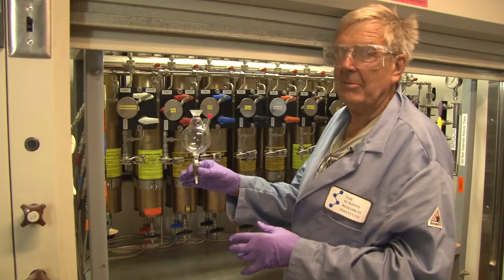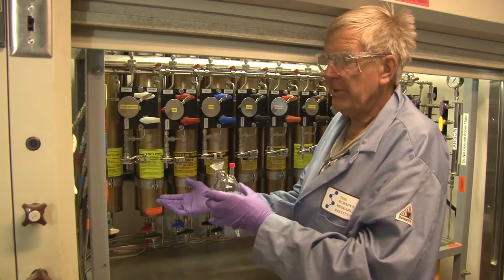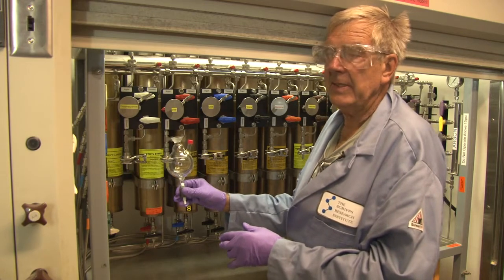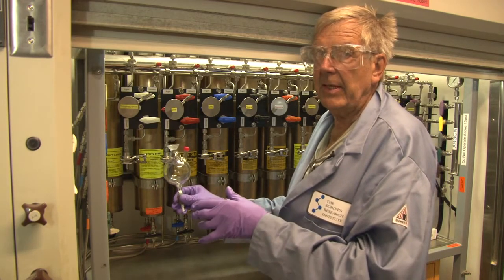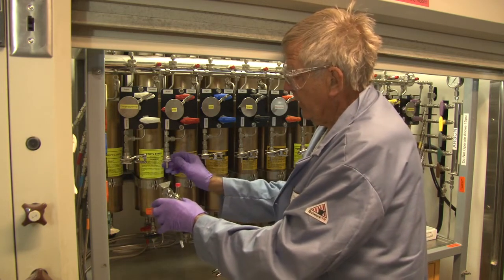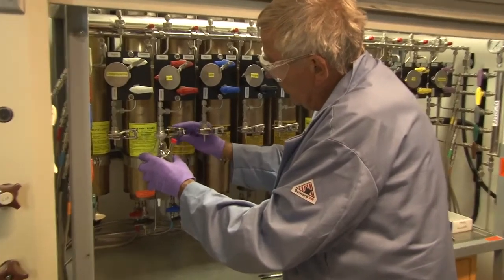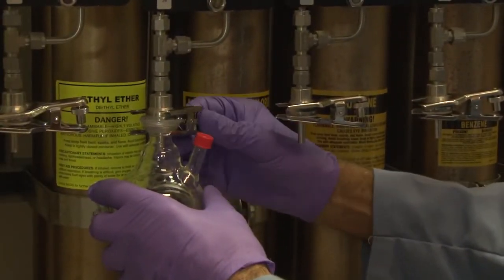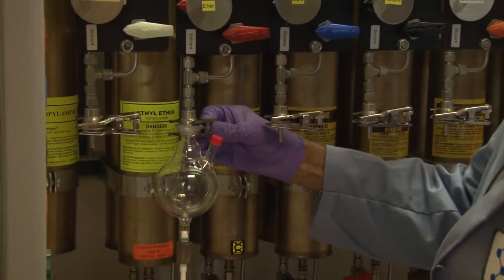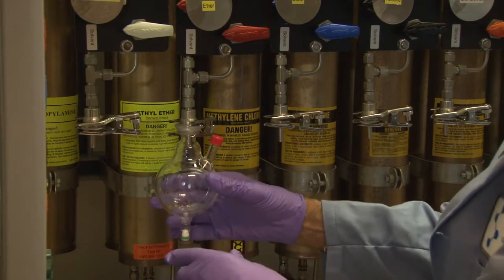This represents a standard model take-off flask for solvent. Some groups prefer to take it through adapters into a flask directly. However, this is the only sure way of extracting solvent anhydrous and anaerobic. So you have a ball-and-socket clamp and a solvent-proof O-ring. The ball-and-socket joint is used so operators do not get a 24/40 standard joint stuck on there and have it break in their hand trying to get it off.